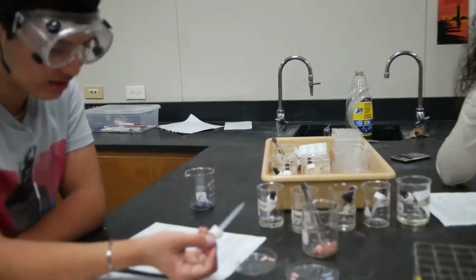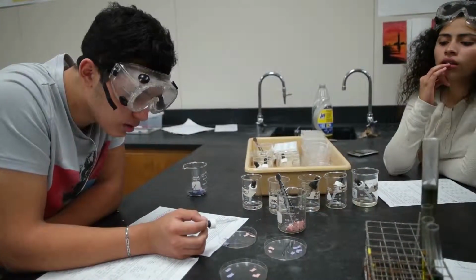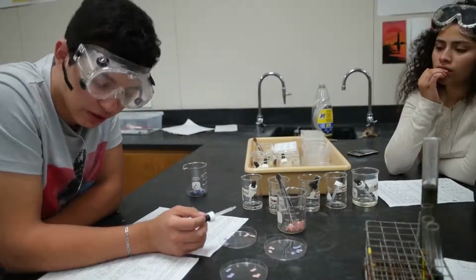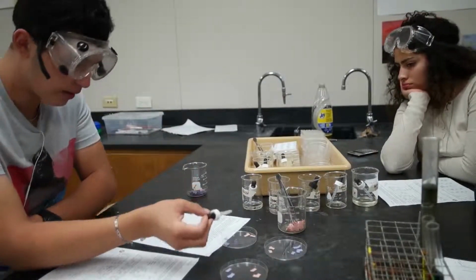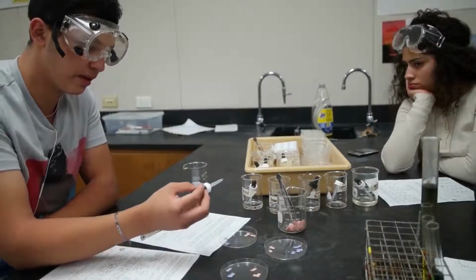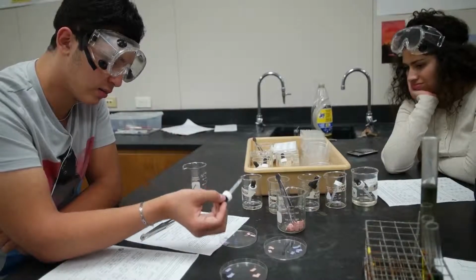And since the paper stays blue, actually, did you say it was ammonia? Yeah, ammonia. I got you. Okay. And since the paper stays blue, it means it's a base. And if you try it on the red, the red will turn blue.